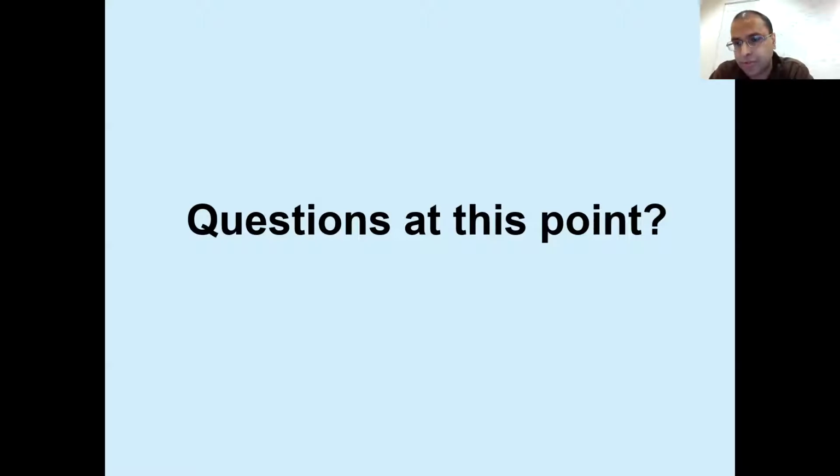Yes, thank you for that question. And in fact, I will talk about that, Karina. Thank you. Yes, so just like any other form of optical microscopy, if you have very densely scattering tissue, as you say, you will have this problem, right? Especially at low wavelengths where the light is scattered a lot.